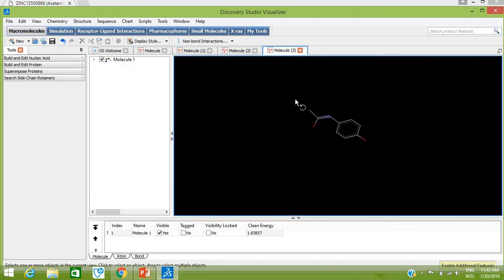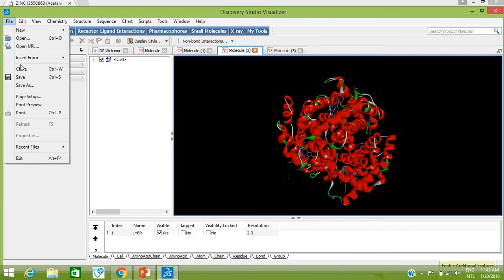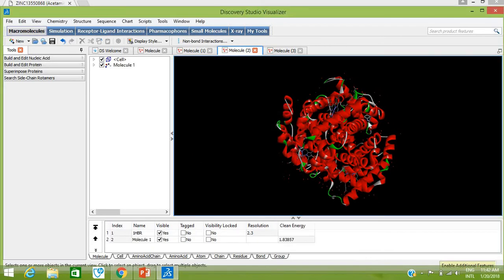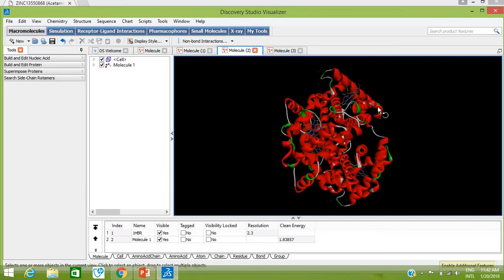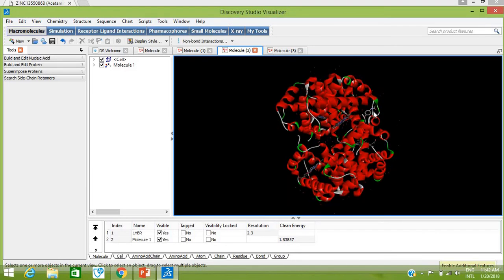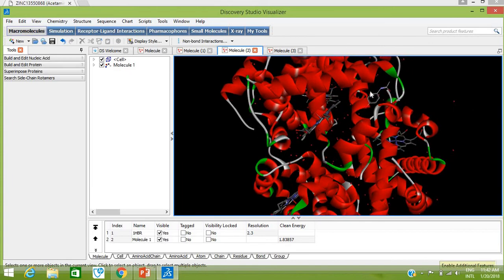You can also insert the same paracetamol structure into the same window. Go to Insert From SMILES, paste, and click OK. Here is the drug paracetamol structure — you can see it has been inserted into the molecule.